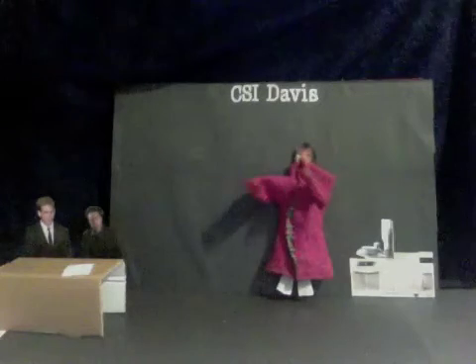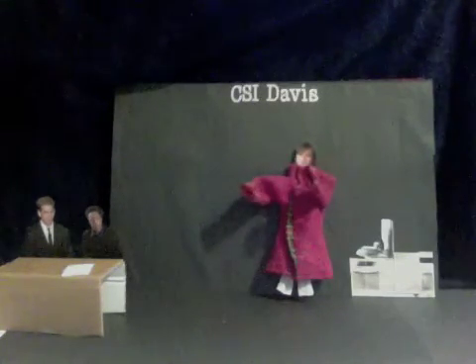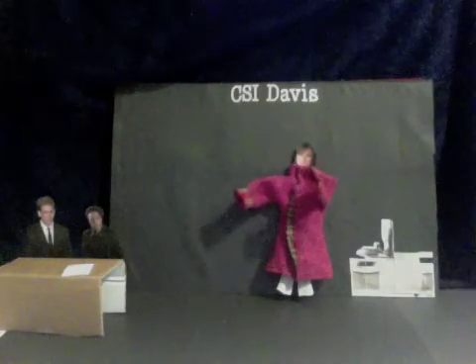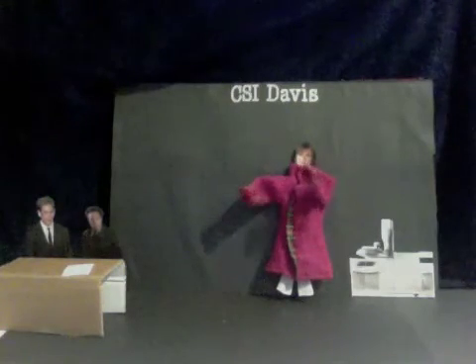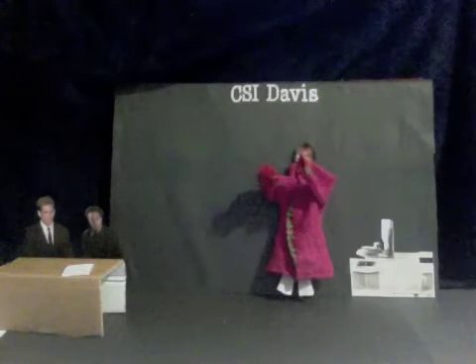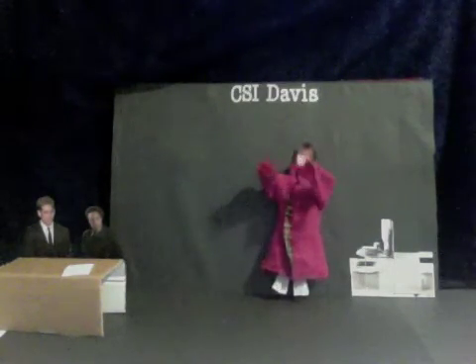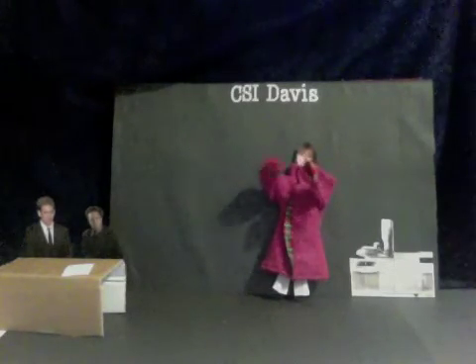The column itself contains two phases, the mobile phase and the stationary phase. The mobile phase is the carrier gas, and the stationary phase is usually a gel, silica, or alumina. The components elute off, with the lower boiling point components eluting off first, and the components with higher boiling points coming off later. This way, we have the components all separated.